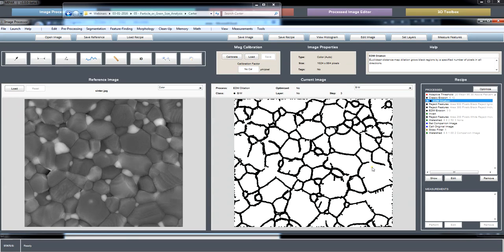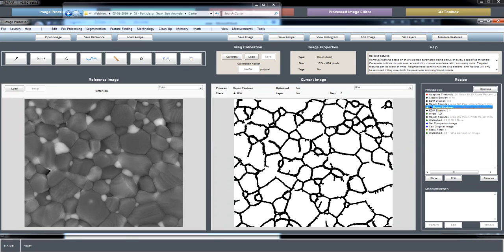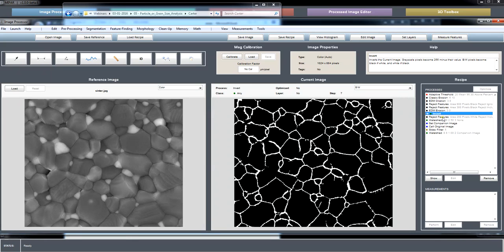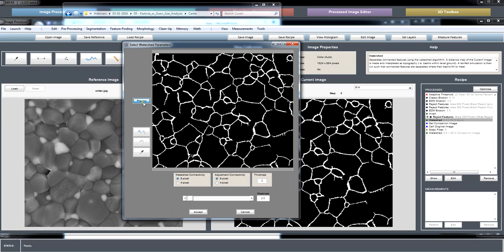You're going to lose a few boundary segments here, but it's not so bad that watershedding can't come in and fix those. Then we shrink the boundaries back down, we invert, we get rid of remaining noise features that won't completely destroy our segmentation, and now we run our fairly powerful watershedding algorithm. This image was the basis of the new watershedding tutorial that's going up as soon as that technical difficulty gets fixed by our website provider.